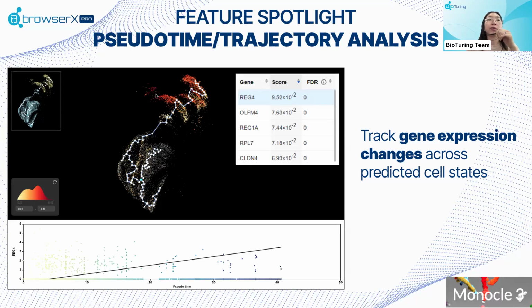I will also show you how to use that feature in a little bit as well. For bioinformaticians and computational biologists, we use this particular package, Monocle 3, to run the pseudotime analysis.